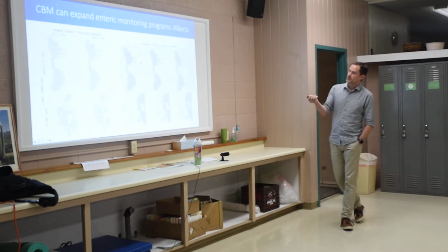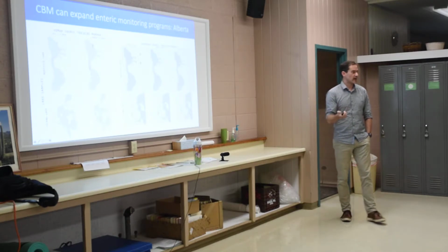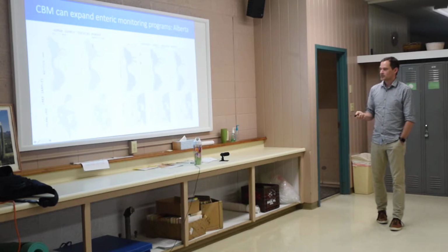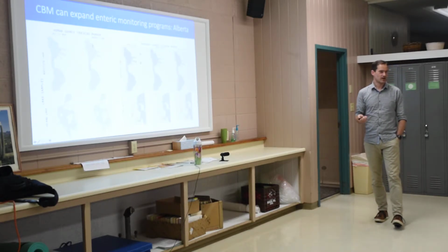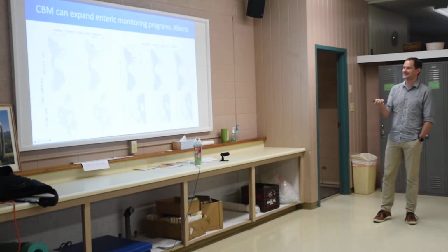Just so you know, there's a municipality on this side right here, and there's a municipality right here, and there's a municipality right there. And so we know that these municipalities are contributing significantly to these human source markers in this area. When we gave them this data, they asked us what they were supposed to do with that data afterwards, and I said, well, you can either tell the municipalities or you cannot tell the municipalities, but this is the data.